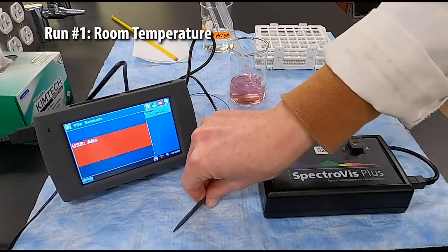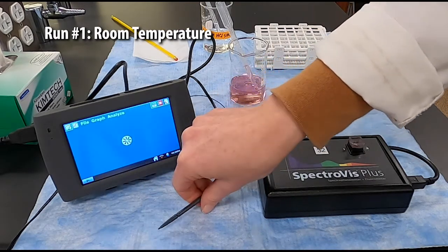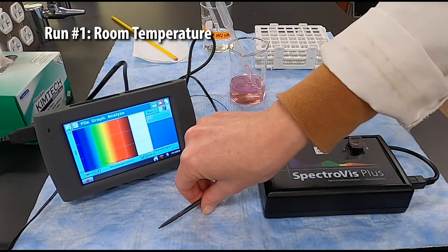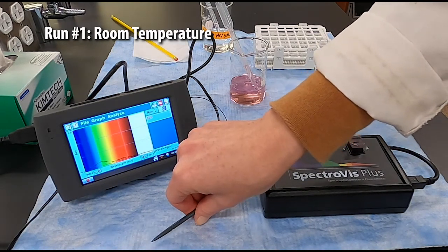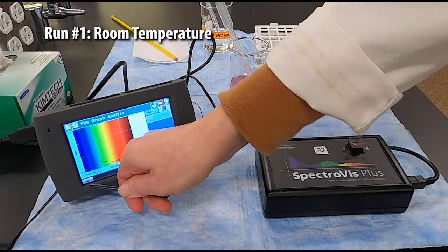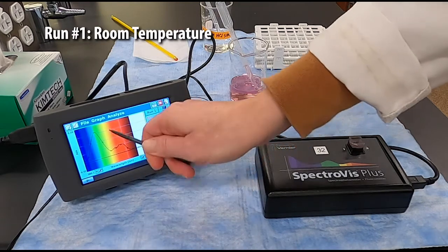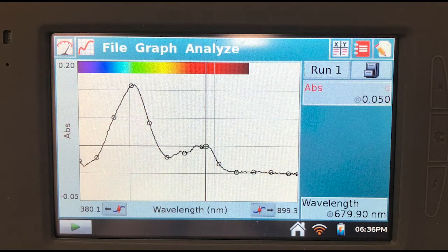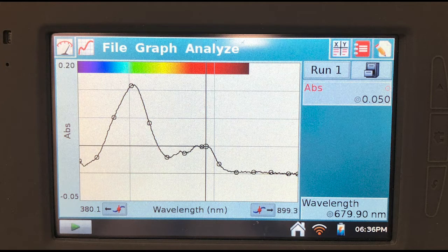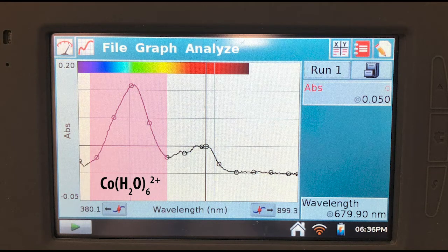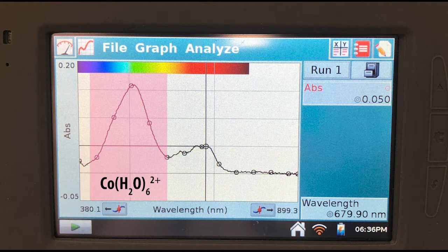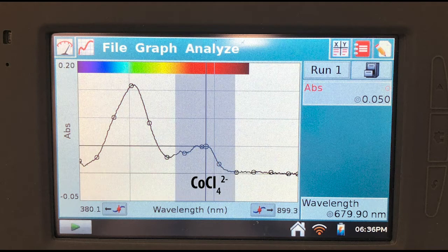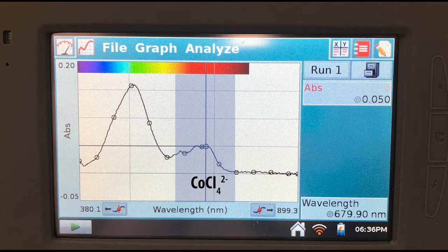Press play to take the spectrum. Our spectrum contains two peaks because our solution is an equilibrium mixture of reactants and products, and there's two species that absorb. The one on the left is due to the hexa aqua cobalt II complex, which appears pink, so it absorbs in the greenish blue. And the one on the right is our tetrachlorocobalt II product, which appears blue, so it absorbs in the orange.